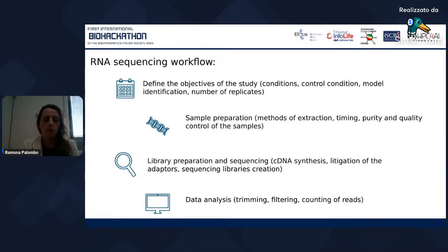In fact, we know that the cells that are inside the tumoral mass are very different in terms of viability, but also in biological processes that are activated in these cells. So if I take just the edge of the tumor, or maybe just a portion that is not so similar to the other parts, maybe I can create confusion also in the analysis of the data.